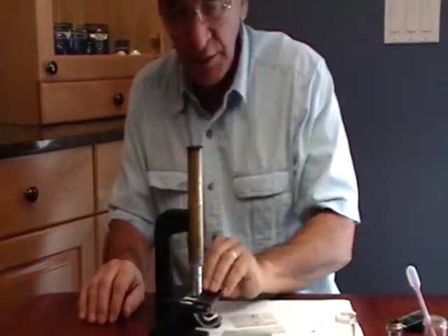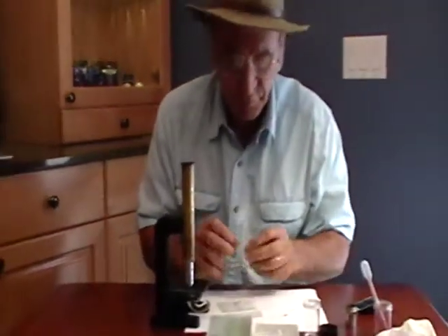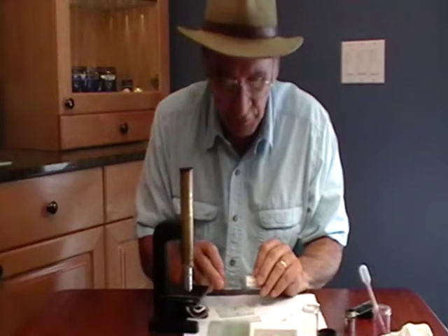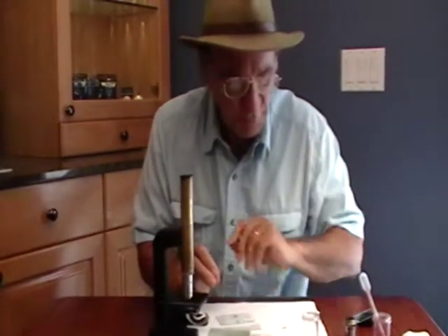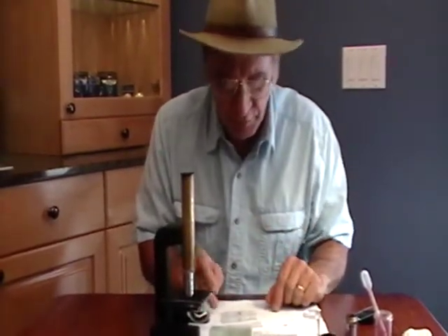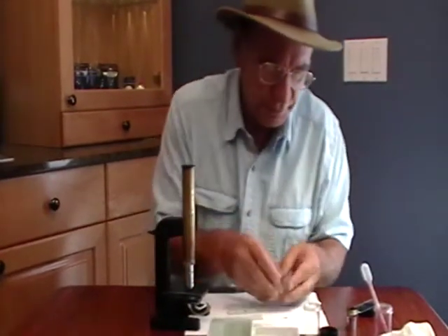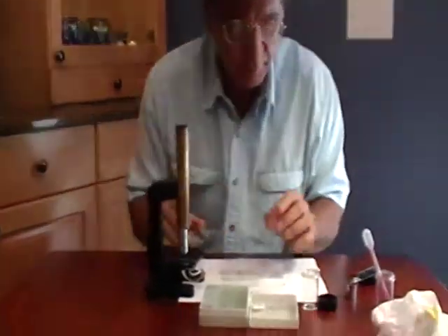You're going to be using either prepared slides, which come in cases — bought by the thousands in every different subject you can imagine — or you're going to make your own slides. And if you make your own slides, you're going to be using cover glasses, which are very difficult to use. Very small, very thin. This is one here — it's a little stained red from previous experiments.